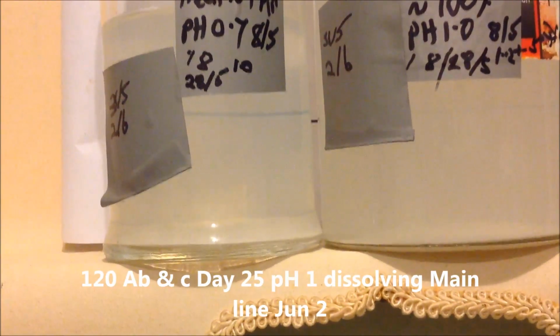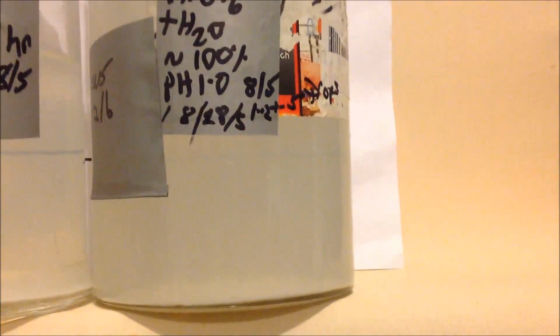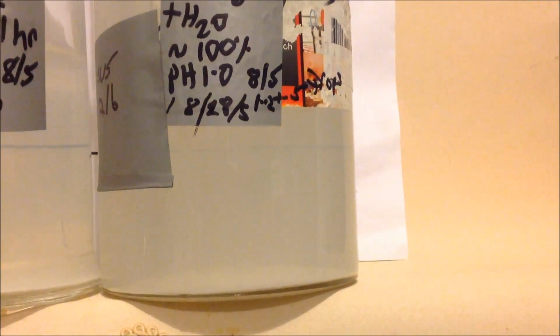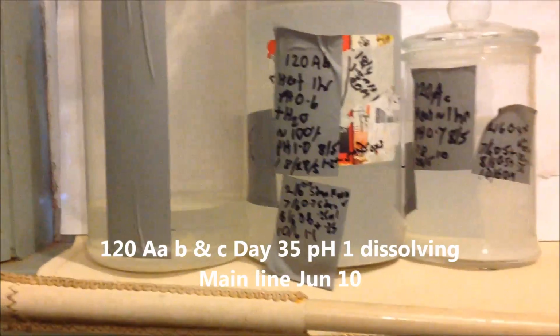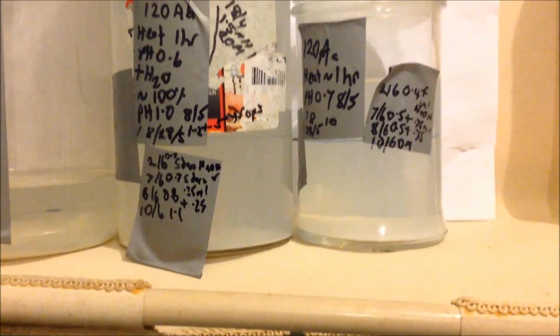120A, sample C, we can now see the line across the back of the solution very clearly, so it's clearing very well. And even sample AB, you can see the line quite distinctly across the back, so it's definitely clearing. Time is dragging on. A has long ago cleared, but the two heat treated ones still have not. C's quite clear, you can see a line drawn across the back there. B is also clearing. I can now much more clearly see the line.